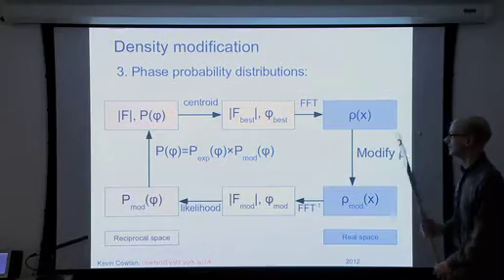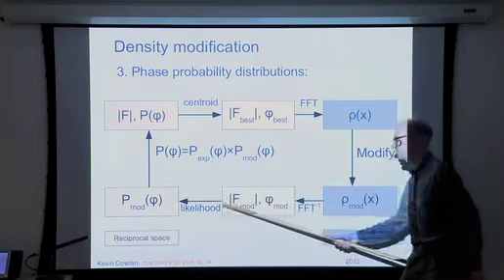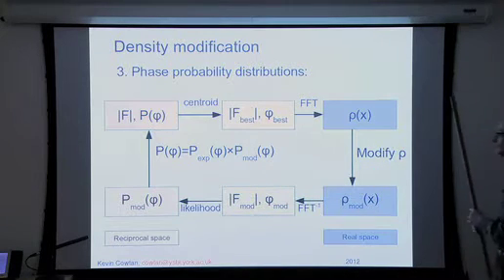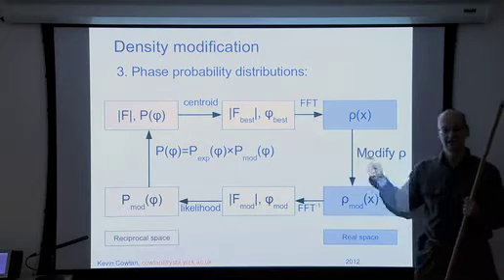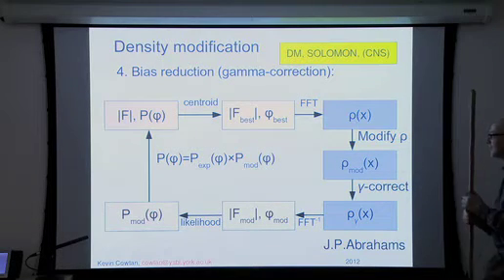So there's a problem. In fact, this probability distribution is very strongly dependent on this one, because we got it through this cycle from the original one. So there is a tendency towards bias in this calculation. You run this calculation over and over again, and all your figures of merit creep up towards 1 without the errors going towards 0. So the figures of merit are overestimated. You've got bias.